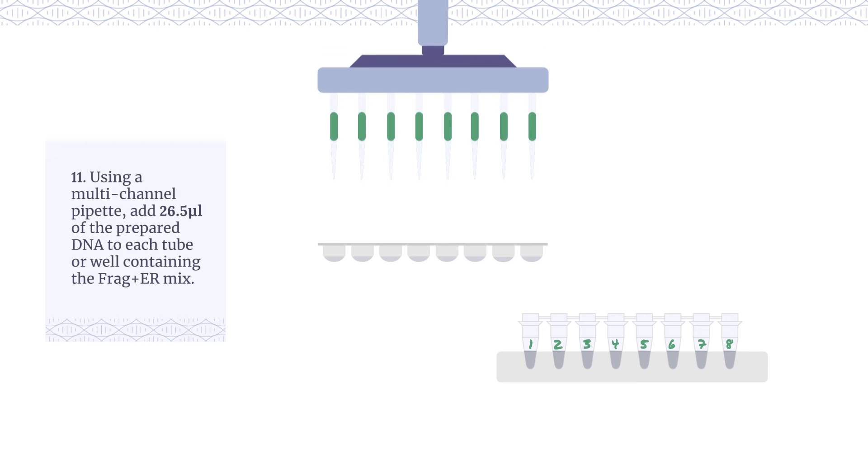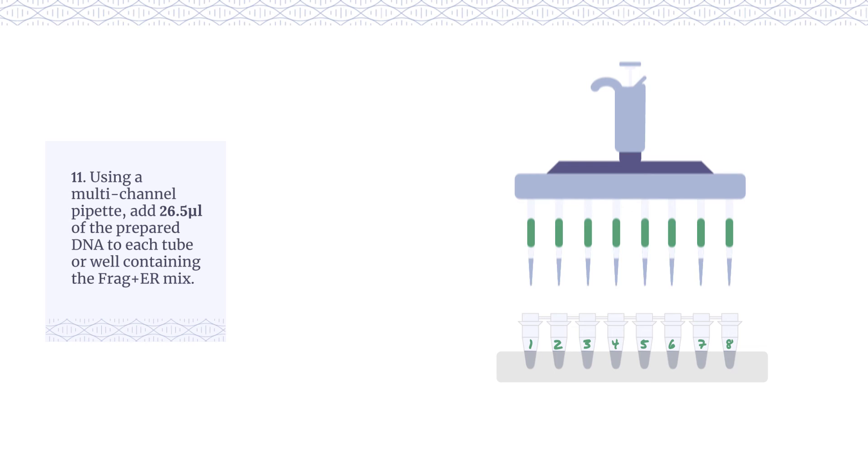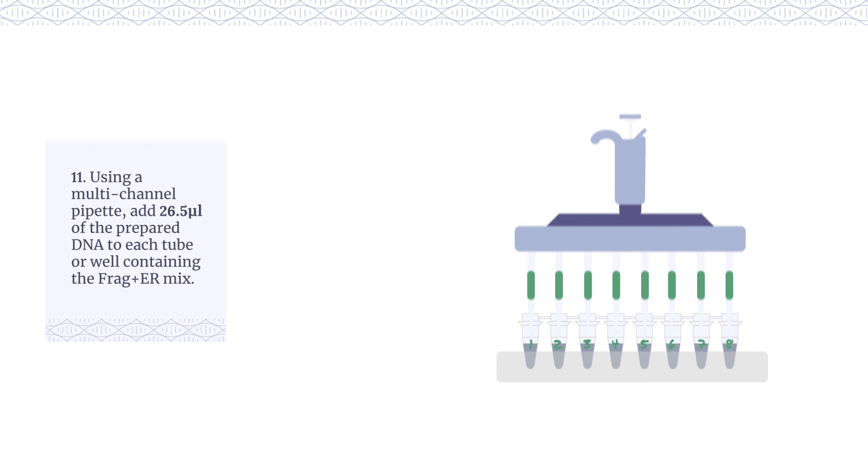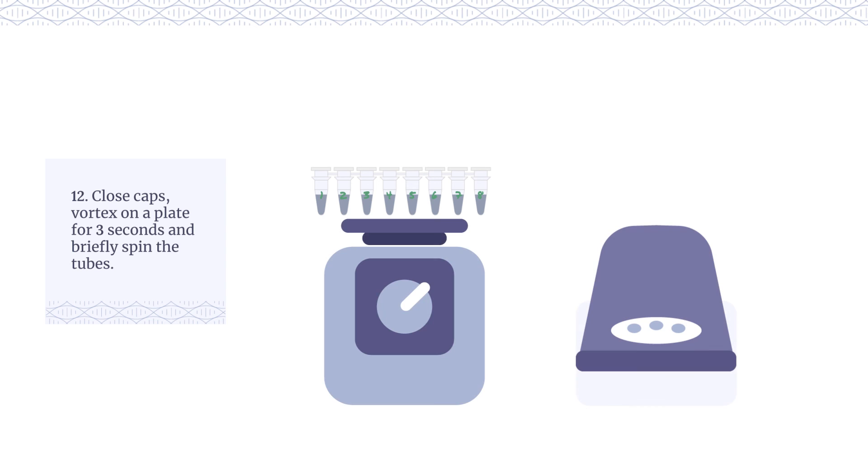Using a multi-channel pipette, add 26.5 microliters of the prepared DNA to each tube or well containing the Frag Plus ER mix. Close the caps. Vortex on a plate for 3 seconds and briefly spin the tubes.